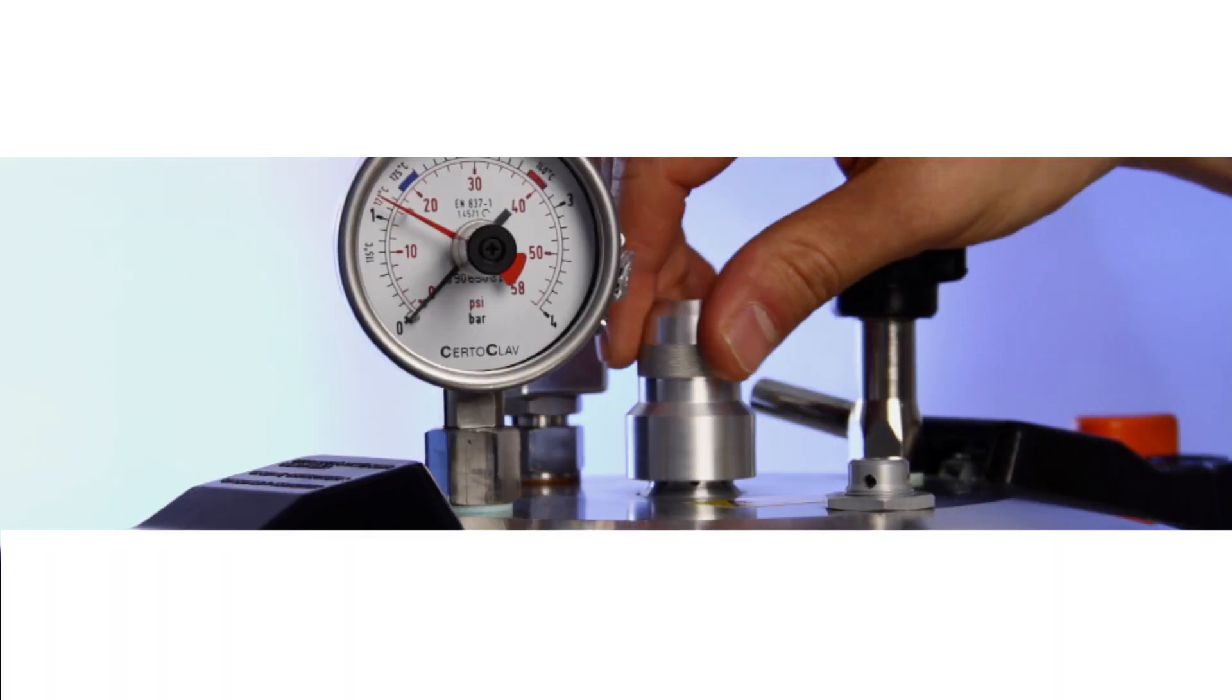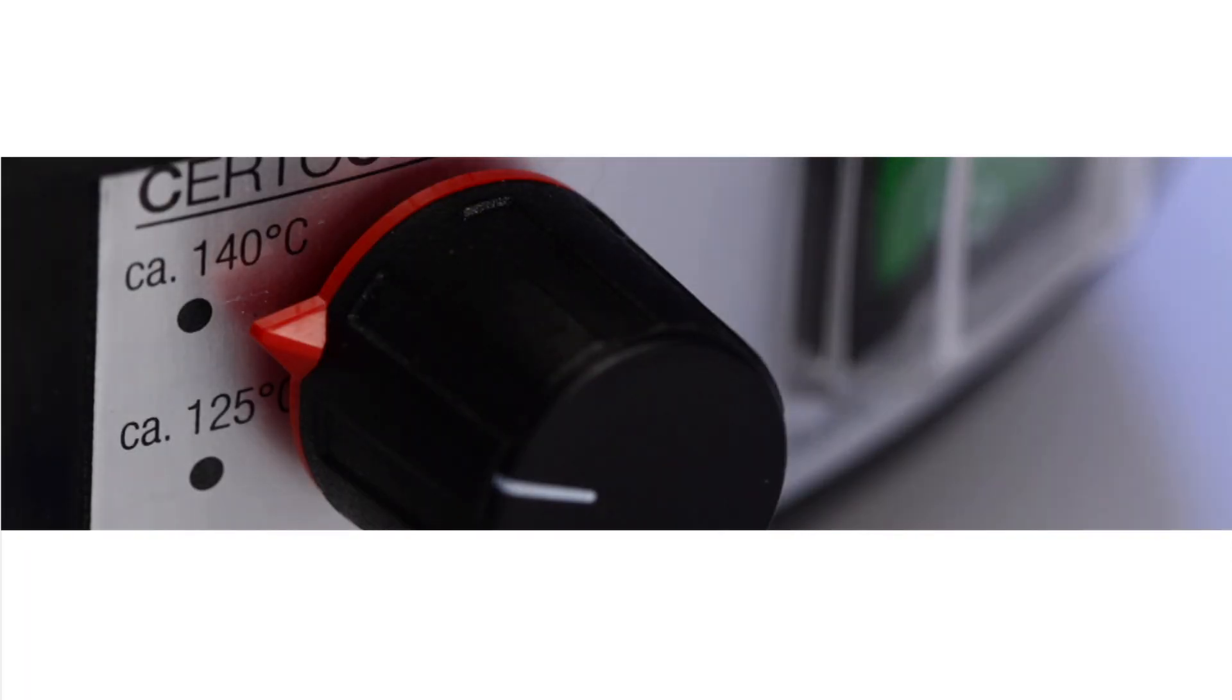Second, program selection. The program is selected through the valve and the temperature control found at the device bottom. Your temperature selection may range between 125 and 140 degrees.